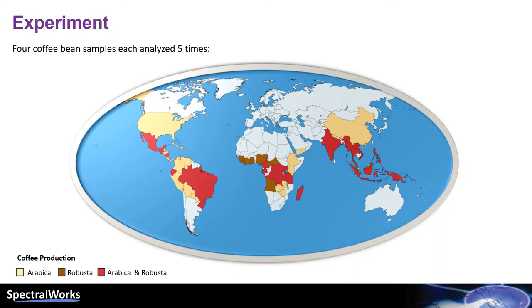For this experiment, we acquired 5 replicates of coffee beans from Indonesia, Ethiopia, Guatemala and Brazil.